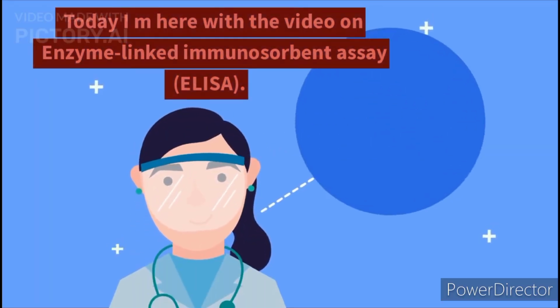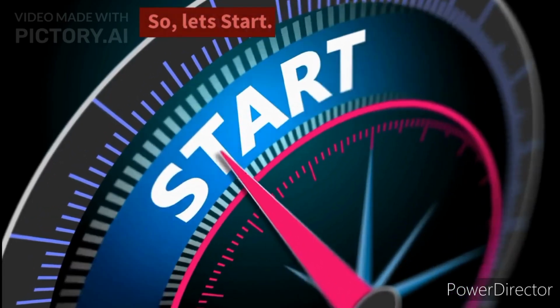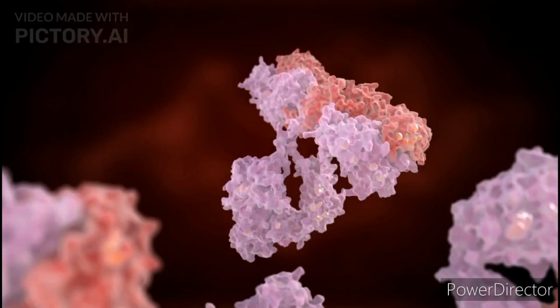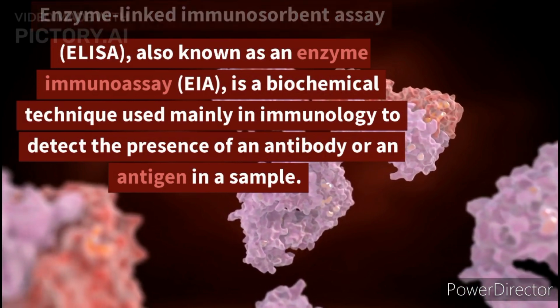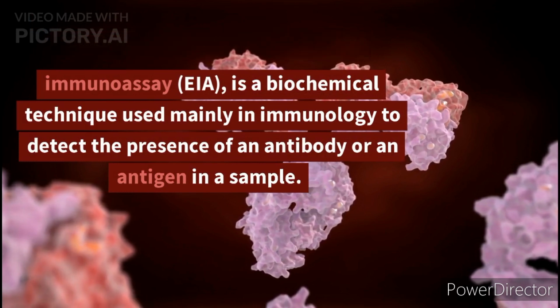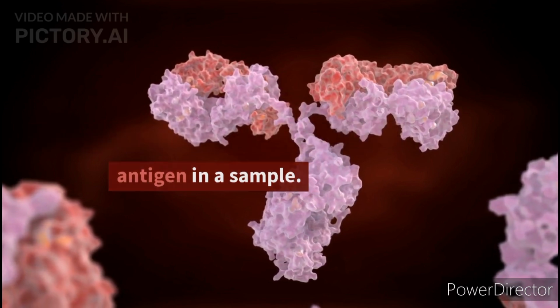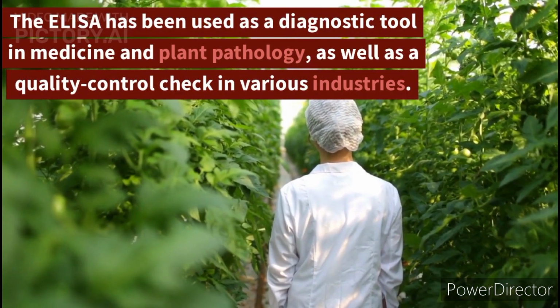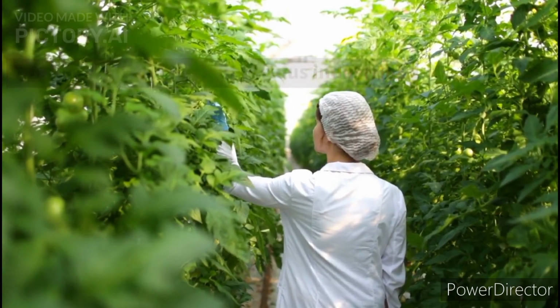Today I am here with a video on enzyme-linked immunosorbent assay, ELISA. So, let's start. What is ELISA? Enzyme-linked immunosorbent assay, ELISA, also known as an enzyme immunoassay, EIA, is a biochemical technique used mainly in immunology to detect the presence of an antibody or an antigen in a sample. The ELISA has been used as a diagnostic tool in medicine and plant pathology, as well as a quality control check in various industries.